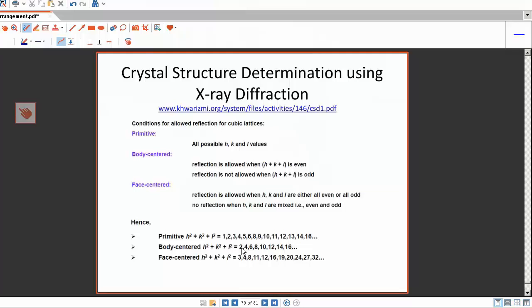Perhaps we could try to normalize the first number to 2 and see if we get a sequence that looks like this. However, I don't think this will work, because had we normalized the first number to 1, we should have got a sequence 1, 2, 3, 4, 5, 6, and includes 7, indicating it's not a primitive.